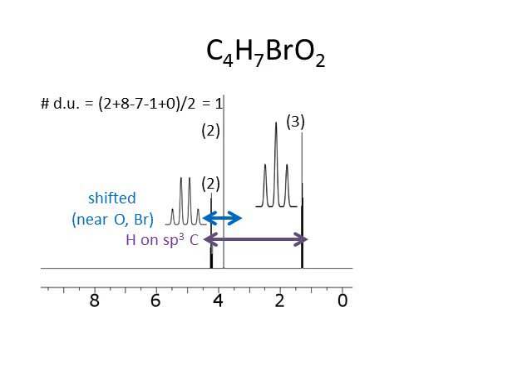All right. What else do I know? Oh, integration. 2, 2, and 3. So the relative sizes of this signal versus this signal. I notice these are very different heights, but this one's essentially a very tall, very narrow triangle. This one is a shorter and fatter pattern of, it turns out to be 4 triangles.